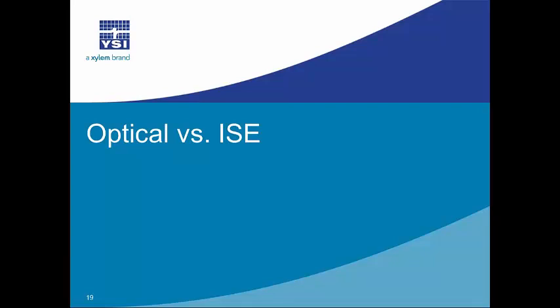Well, it's really a good time to monitor nitrate, and we have two very good options for that. And I'm going to compare and contrast a little bit optical nitrate monitoring versus ion selective electrode nitrate monitoring.